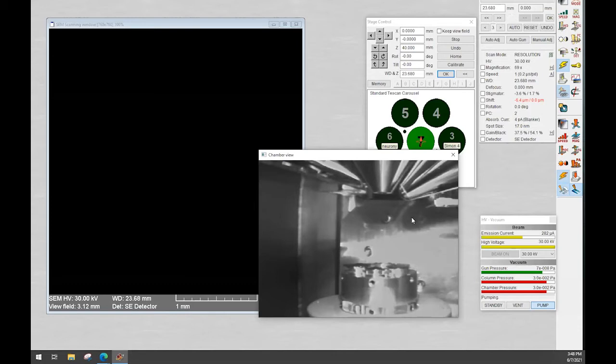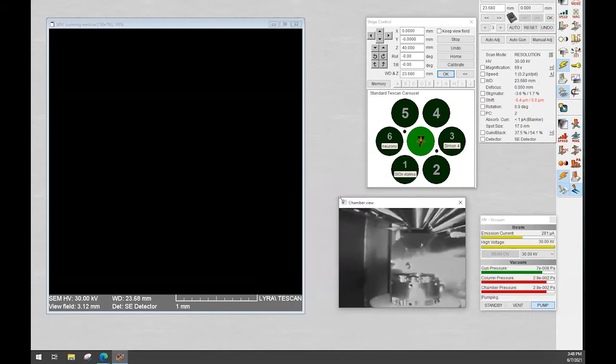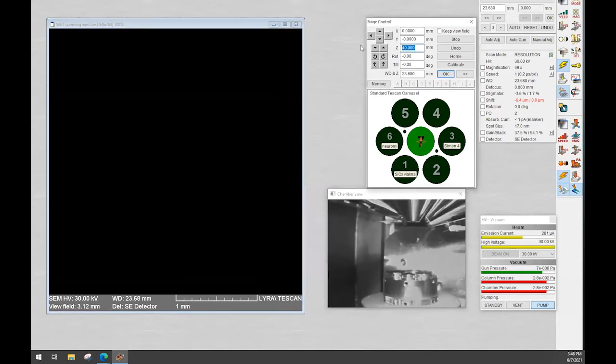So we will be able to move. And this part, it's moving now. It's backscattered electron again. So similar like the previous one. Okay. So I will go closer, just waiting for a vacuum. Okay, here we are.